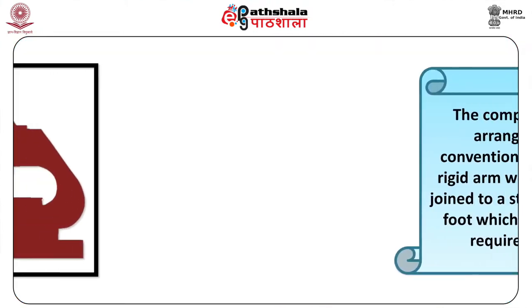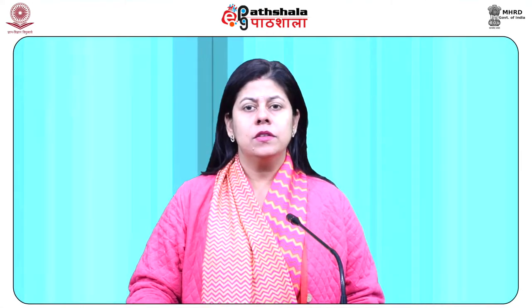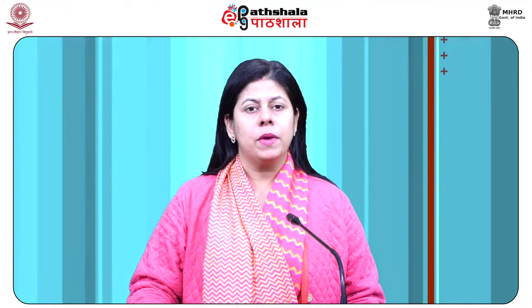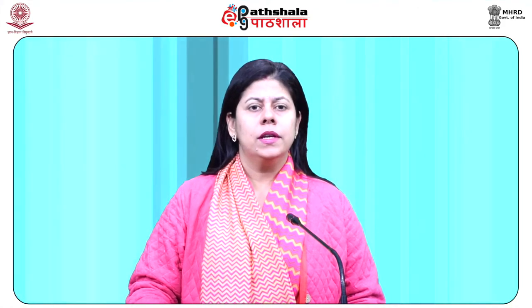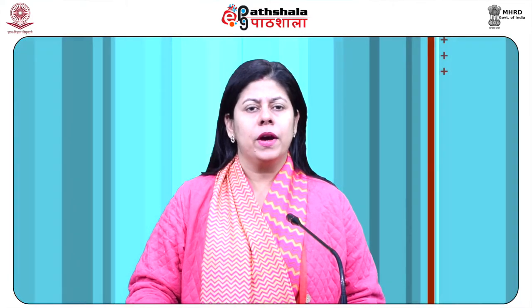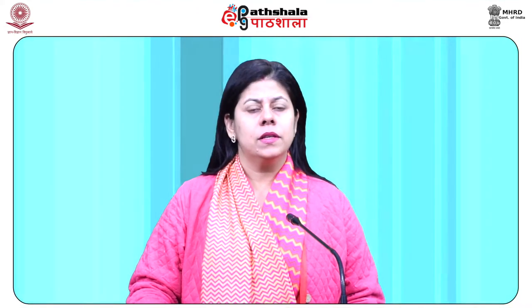Frame. The complete optical arrangement is conventionally fixed to a rigid arm, which is further joined to a strong U-shaped foot which provides the required rigidity. The viewing angle can be adjusted using an arm angle. The frame provides a mounting point for various microscope controls. Various panels for focusing, like a large knurled wheel to adjust coarse focus and a small knurled wheel to regulate fine focus, are present in the frame. The controls for the lamp and condenser are some other features mounted on the frame.